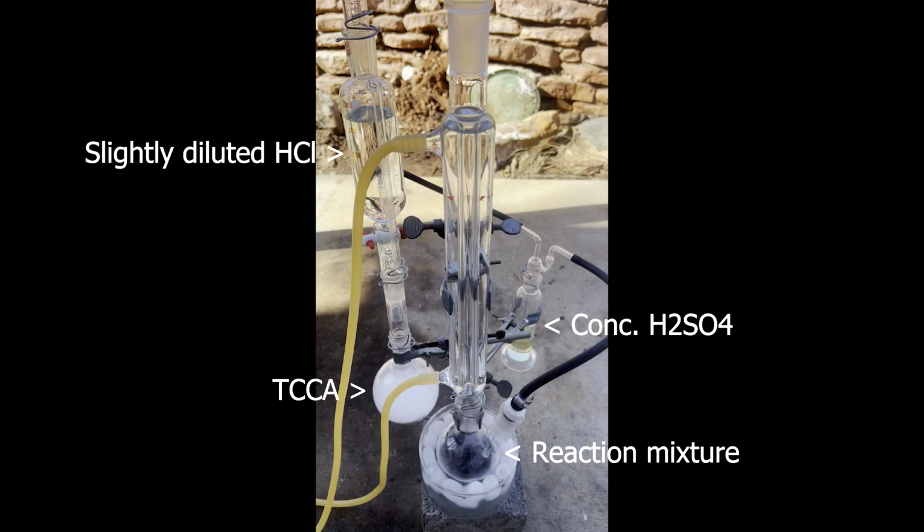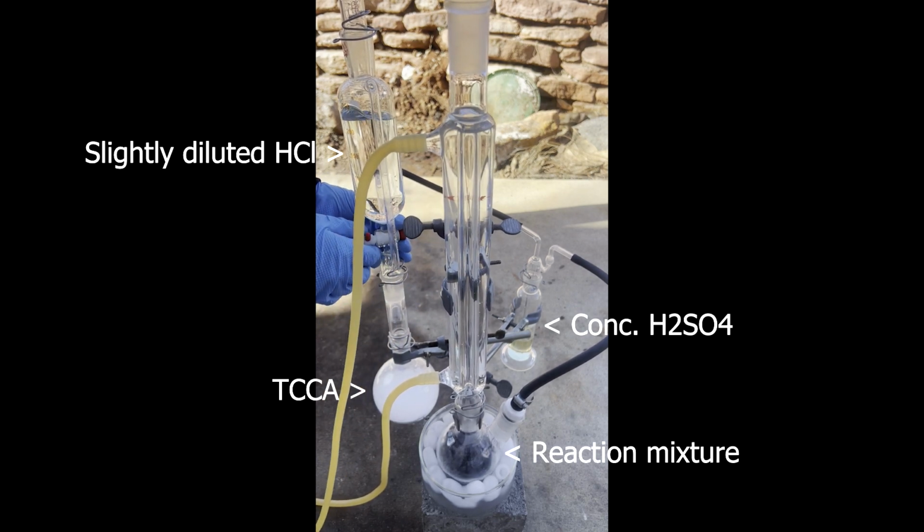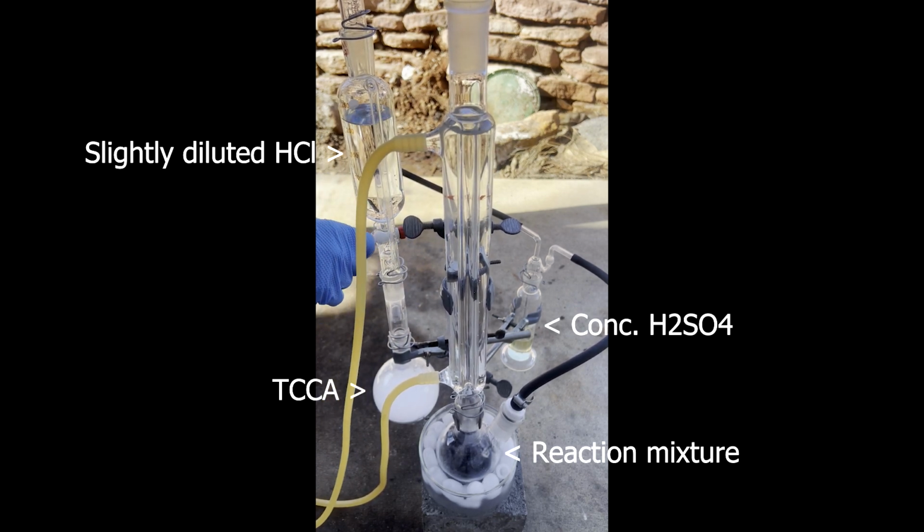This is the setup. It's very compact because I was using all my other ring stands at the time. I diluted the hydrochloric acid a bit and started dripping it onto the TCCA to begin the chlorine generation. The chlorine passes through the wash bottle containing concentrated sulfuric acid, so it dries it.